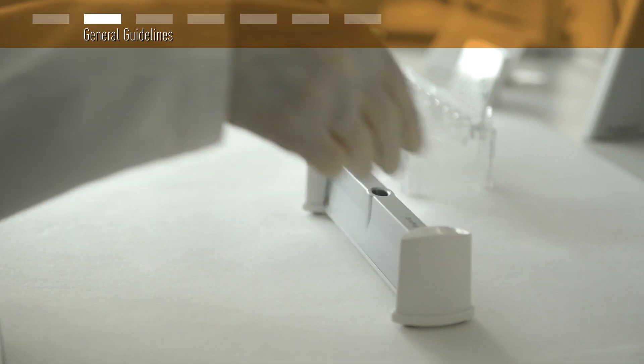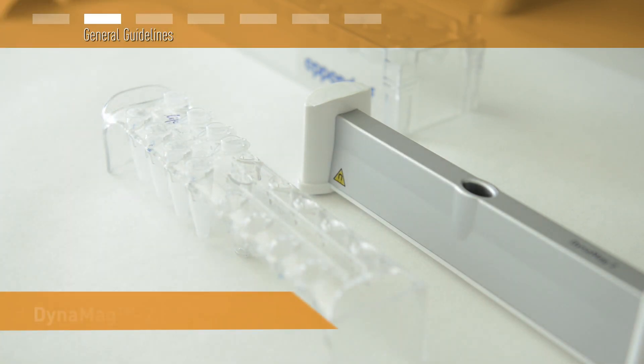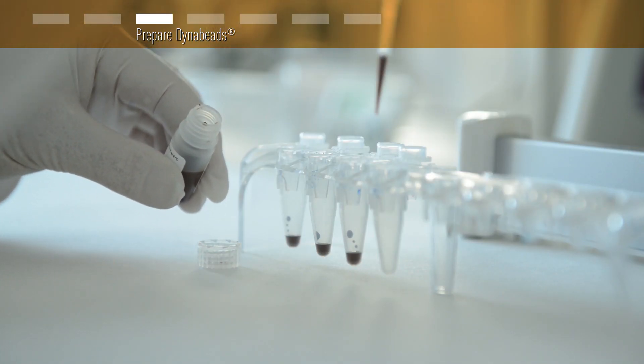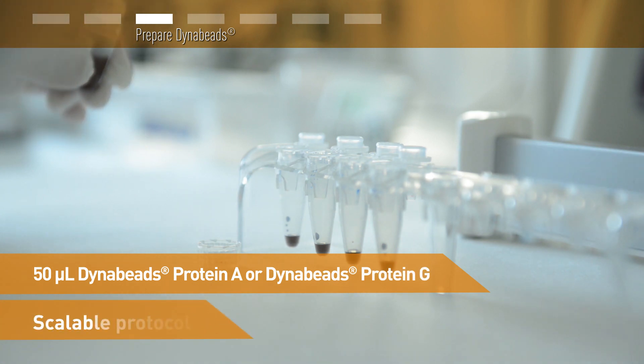No columns or centrifuge is required. The transparent top rack of the DynaMag 2 can also be used as a sample rack. Make sure the DynaBeads are fully re-suspended. For a standard isolation, you'll need 50 microliters, but you can easily scale the protocol to match your experimental setup.